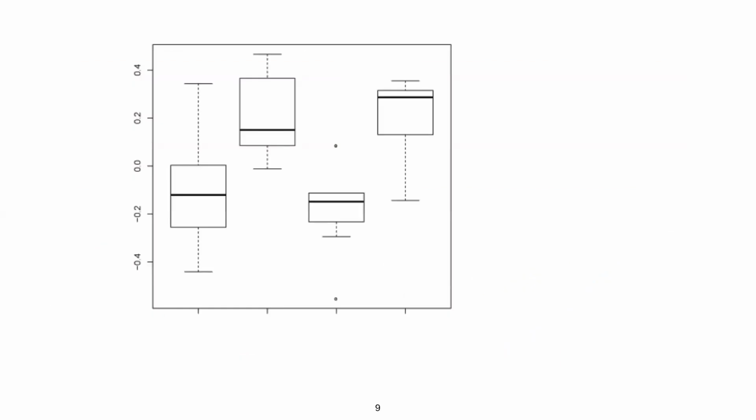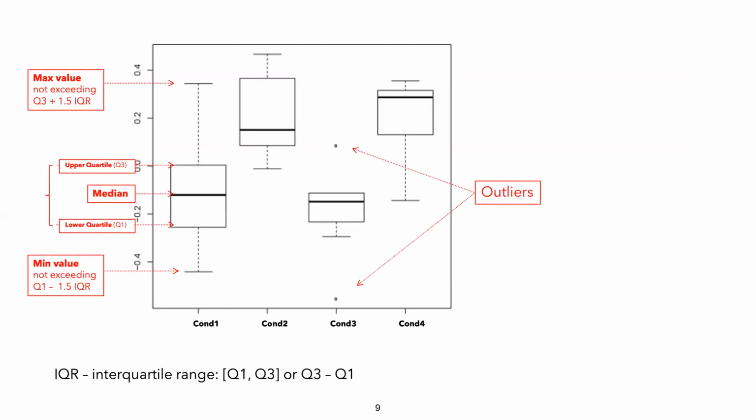Then we also reviewed how to create these box plots. Essentially these plots tell us the max value, whether there are outliers, the median, the interquartile range, the upper quartile, and lower quartile. These summary statistics help you determine whether you want to remove outliers at an earlier point, or whether you actually see a trend in the data. Maybe you don't see anything and you might not want to pursue this particular dataset. These metrics are always important because this is all quality control. You want to make sure you're not going down a rabbit hole or wasting your time downstream of your initial analysis.